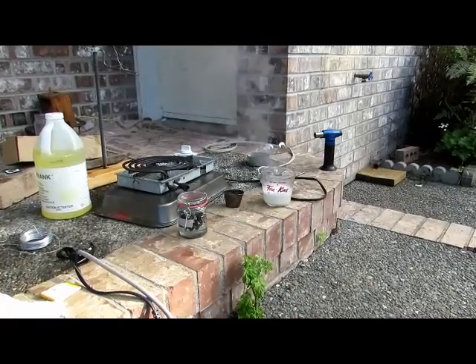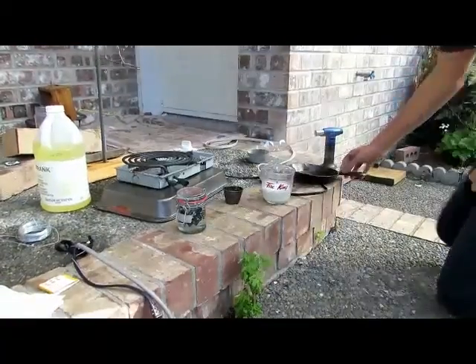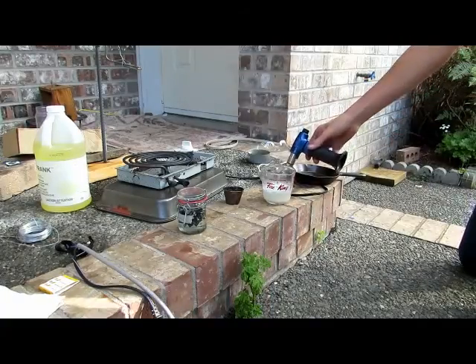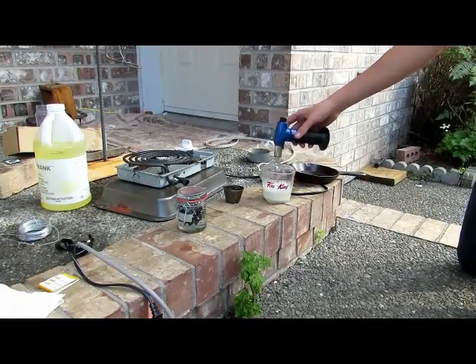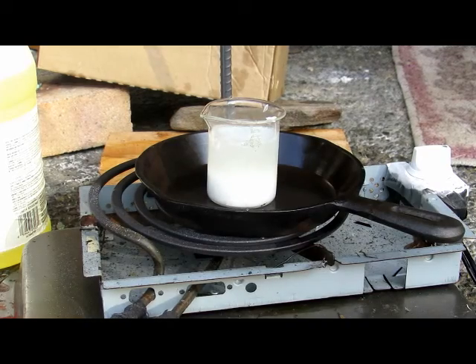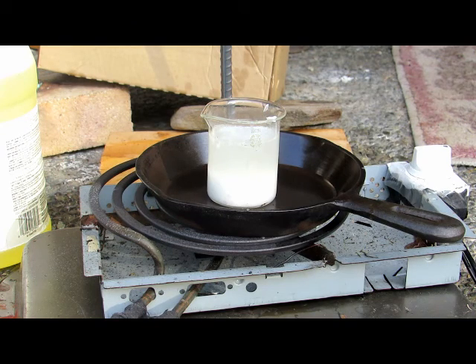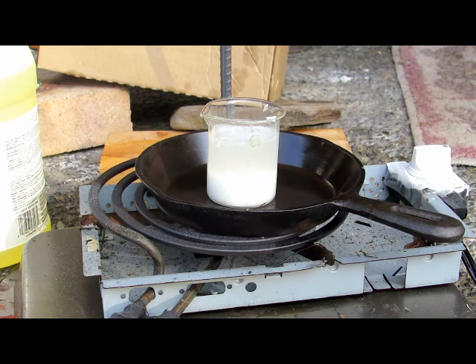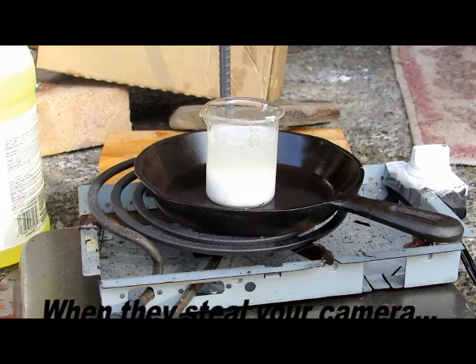Once we've reacted all of the lithium with water, we're left with a bunch of lithium hydroxide, and a bit of it is in suspension. The first thing we need to do is boil it down before going any further. We have it on a burner here on top of a pan and we're going to heat this up until all of the water is gone. We have to make sure all the water is boiled off.